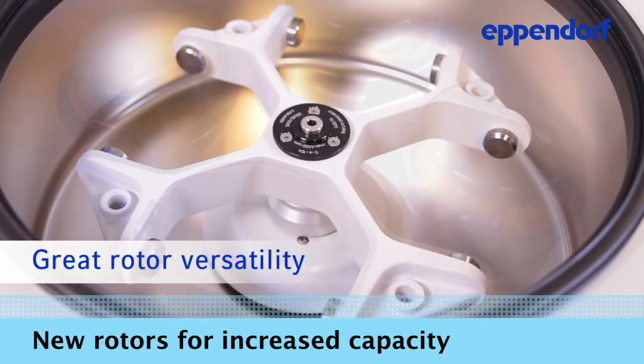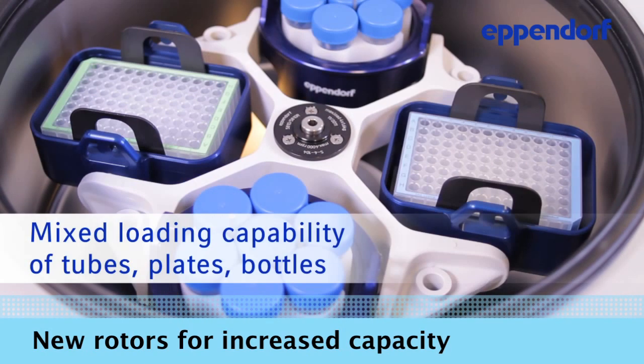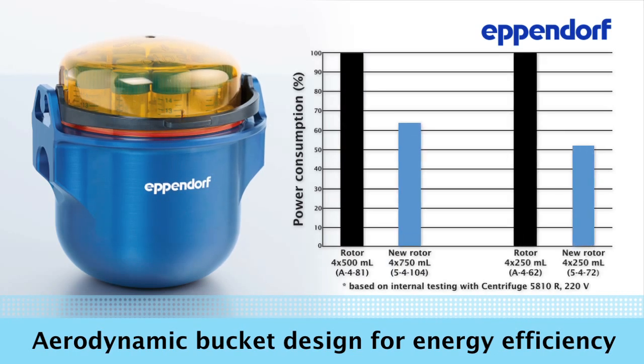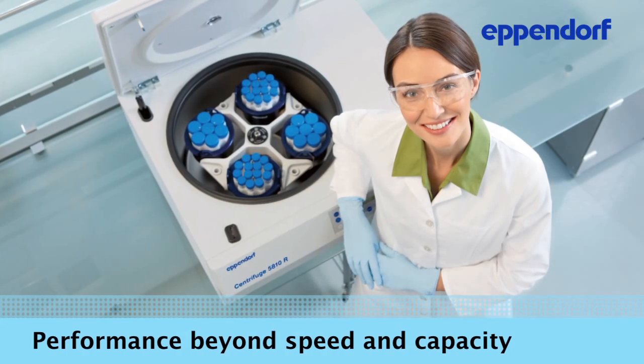The new 3.0L rotor offers many bucket and adapter combinations. The rotor also allows for mixed loading for even more versatility and peace of mind. The new rotors have been specifically designed to be aerodynamic. The more efficient design reduces power consumption by up to 40%.